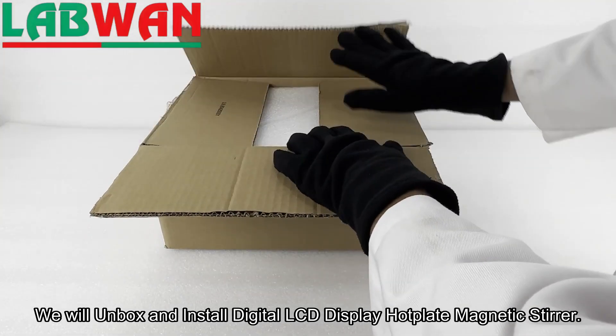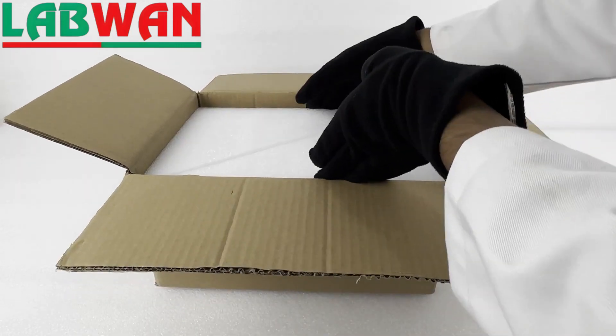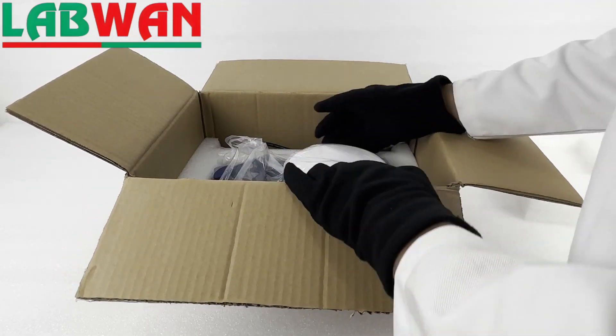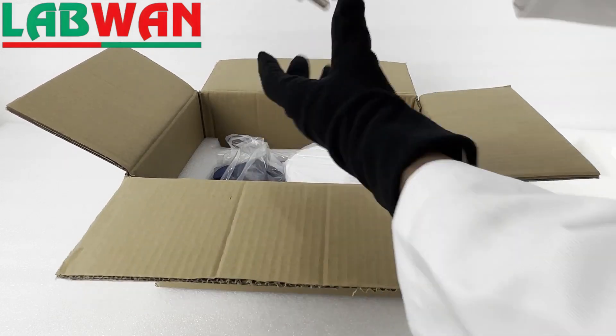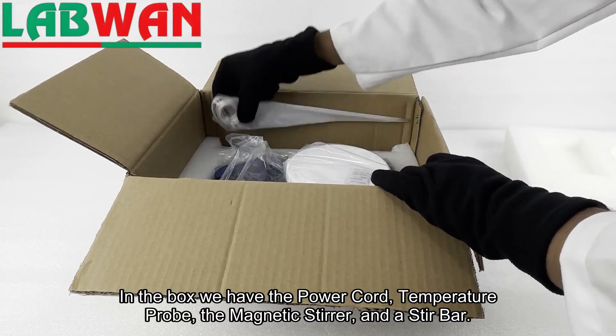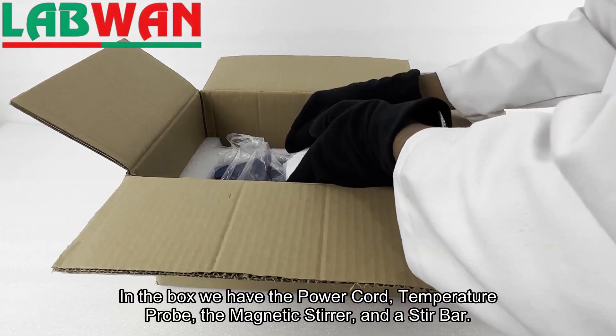We will unbox and install a digital LCD display hot plate magnetic stirrer. In the box we have the power cord, temperature probe, the magnetic stirrer, and a stir bar.